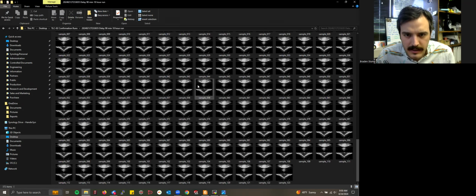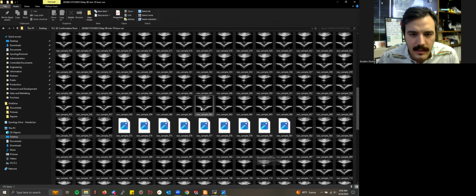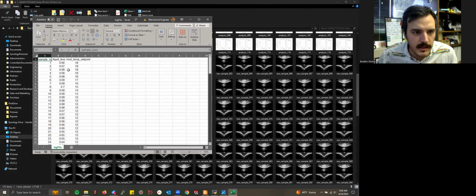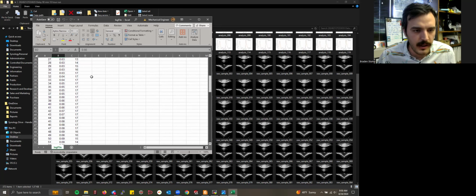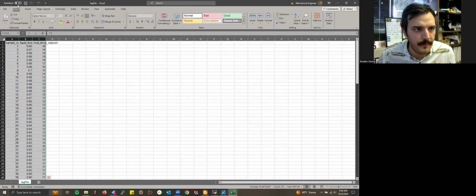You are seeing on this meniscus, this is not changing very much, but when it is changing, it's just kind of slight adjustments. I think on this sample, we did get something a little bit more in our log file here. We're seeing, from what it calls, 660 microliters up and down. And I'll go ahead and graph this so you can kind of see what fluctuation looks like here.